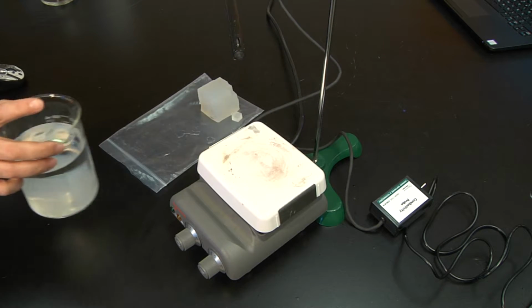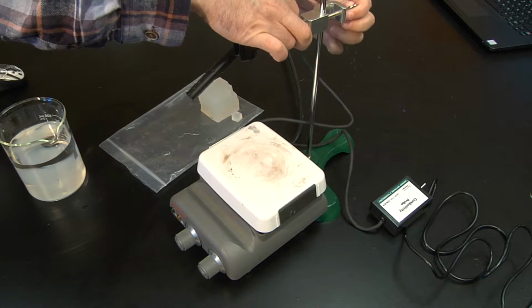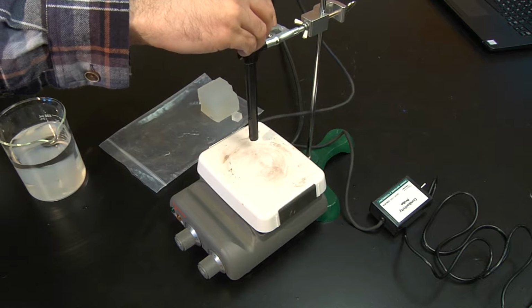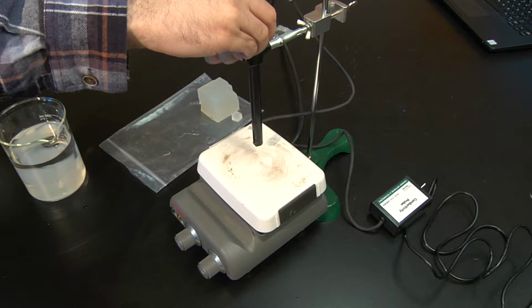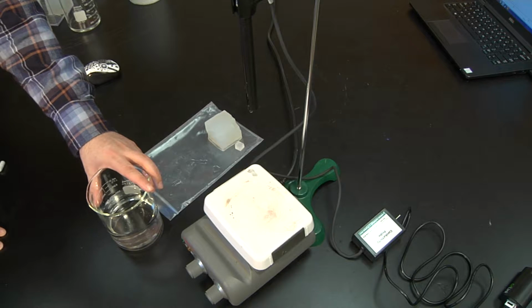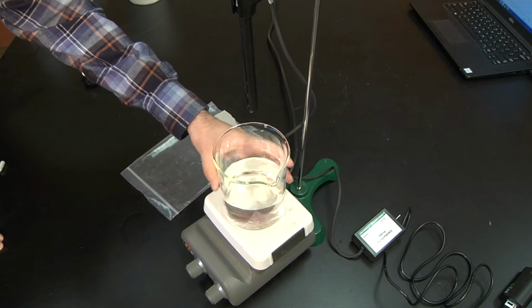I will remove my beaker to clean it up. I will dump all the water and the agar pieces, and I will install my conductivity sensor back onto the ring stand using the clamp. After we clean up the beaker, I replace the water inside it with 300 ml of distilled water. I place it on top of the magnetic stir again.